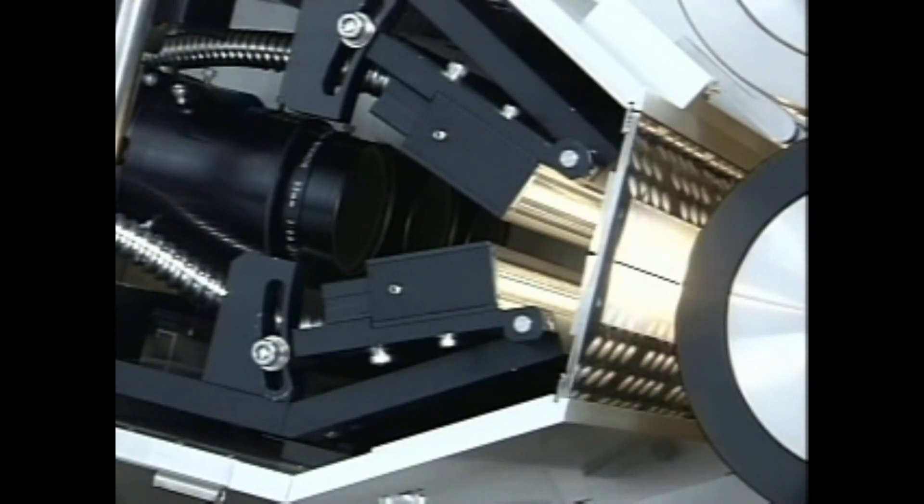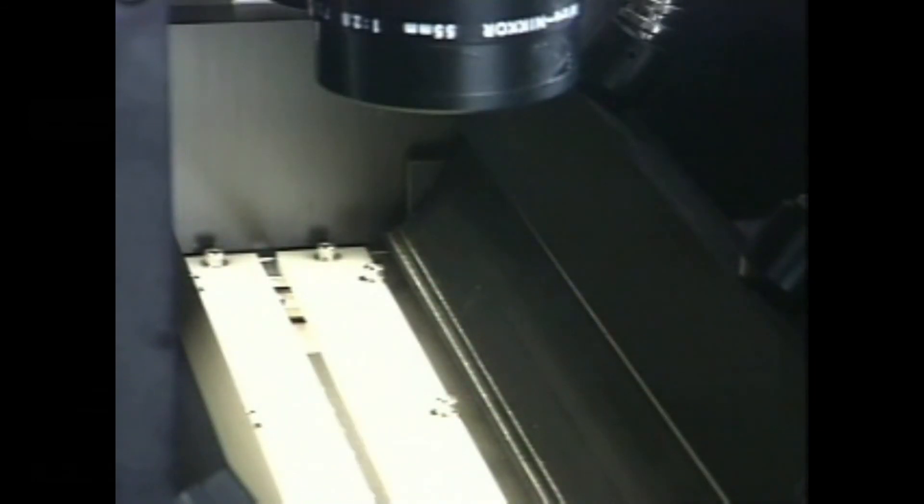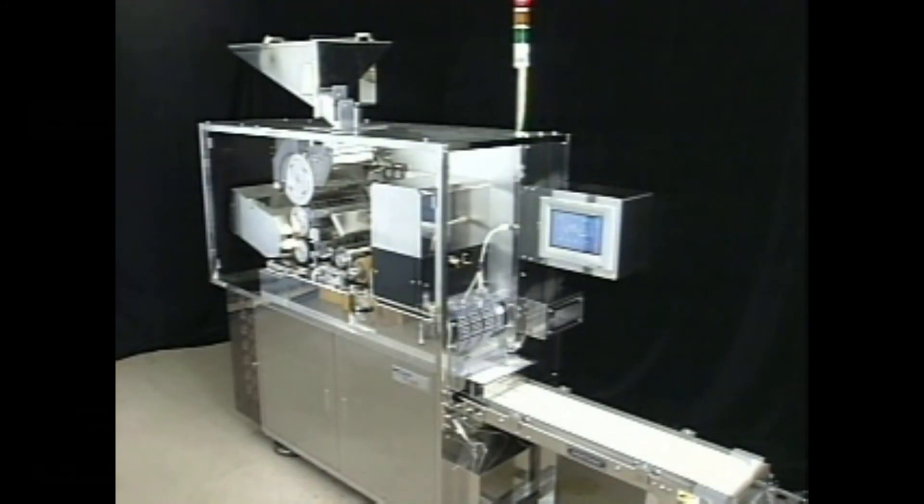Of course, drug products need to be of high quality. Easy identification is absolutely required for each tablet and capsule to allow proper handling. Needless to say, the IS500 is the kind of machine that fulfills such expectations of pharmaceutical companies.